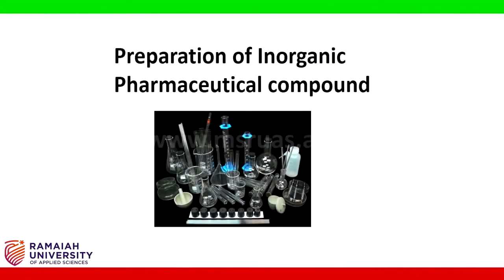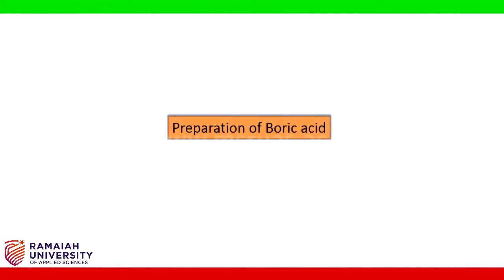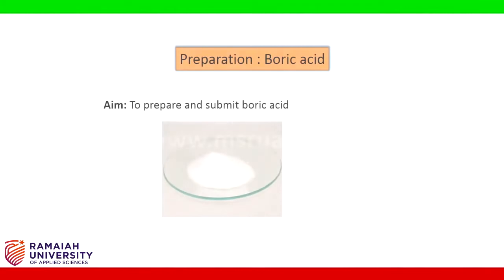Hi students, today we'll prepare a pharmaceutical inorganic compound. The title is preparation of boric acid. The aim is to prepare and submit boric acid.